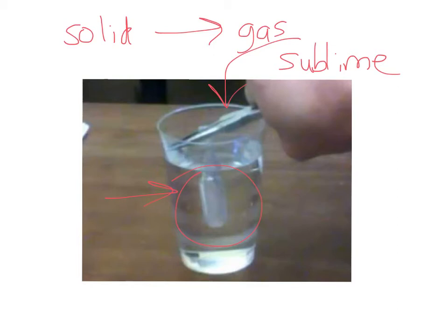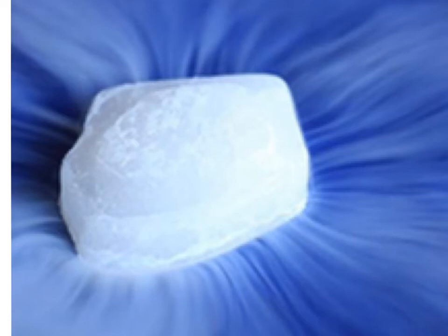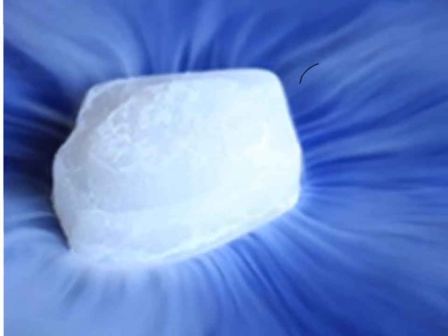You'll see too that dry ice has this interesting smoky look to it, and we need to talk about that. You can see from this close-up picture of the dry ice that it appears to be smoking. In fact, it's not smoking, it's making a fog, and this is the same fog that they use on movie sets or when they do a play. What's basically happening here is that the dry ice is turning to a gas, and that gas is invisible. You're not seeing tendrils of carbon dioxide gas floating away. Right? These are not tendrils of carbon dioxide gas. That's actually fog made of water.